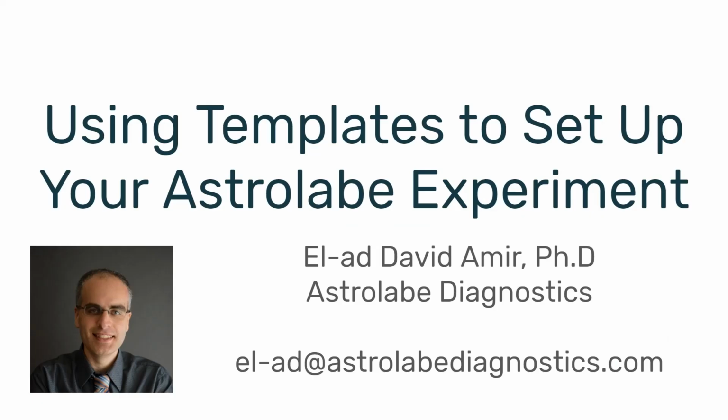And there you have it. The same process works for experiments with hundreds or even thousands of samples. You can download the spreadsheets, update the relevant columns, change the sample names, and upload it back to Astrolabe.